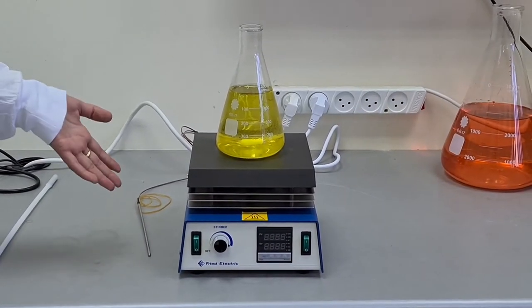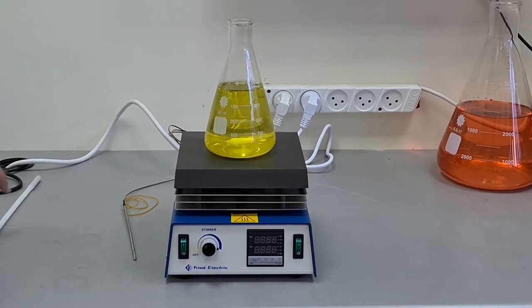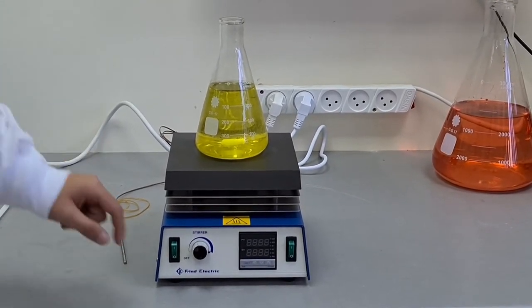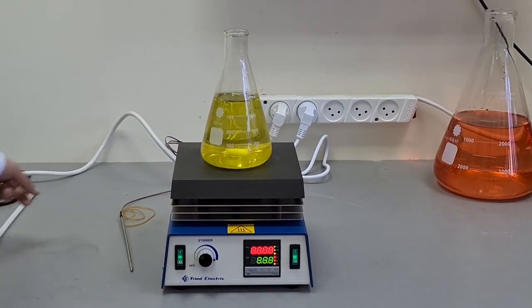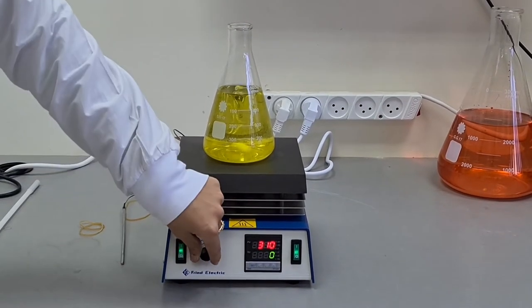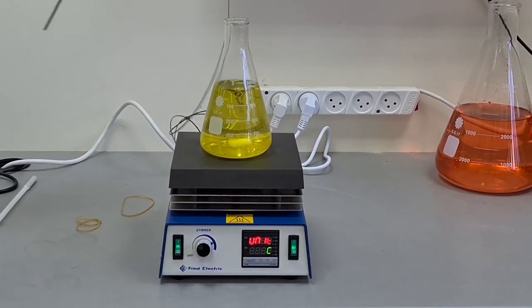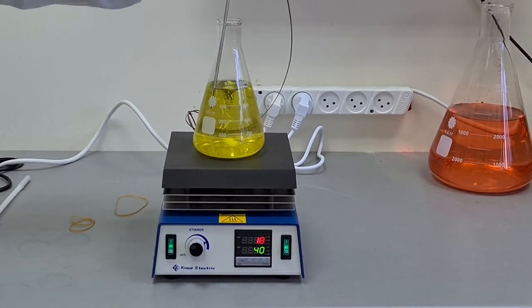Here is a hot plate with magnetic stirring and digital temperature control. We have here the temperature sensor — we put it inside.